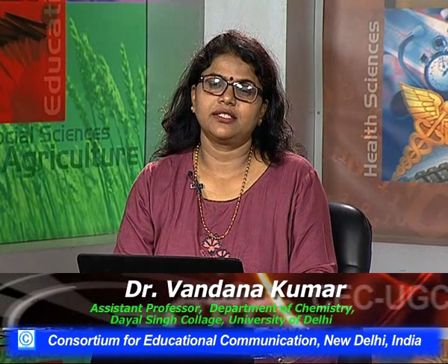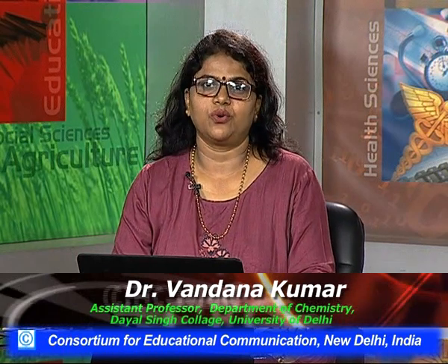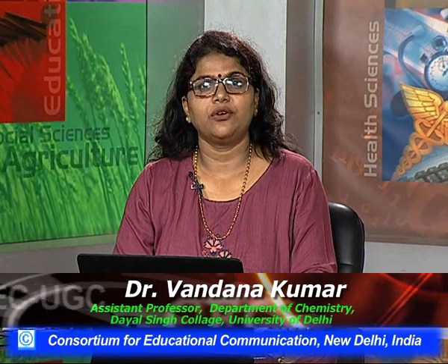Hello viewers, we have started our series Natural Product and Spectroscopy. So why we are discussing this important topic is spectroscopy. To analyze any organic compound we have classical methods. You have to go through several steps. First of all, you need to identify the preliminary examinations for a particular organic compound, which includes the solubility, the liquid state or solid state, the solubility in water or in organic compounds, and the saturation and unsaturation of that particular compound.